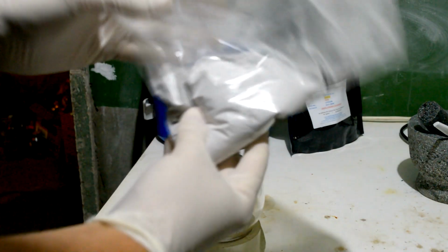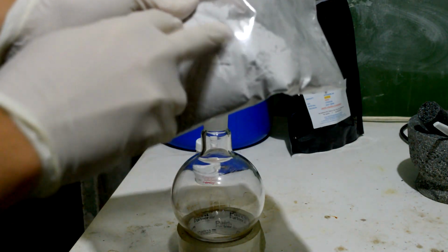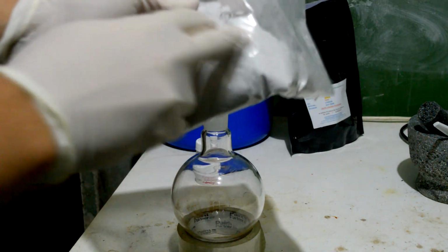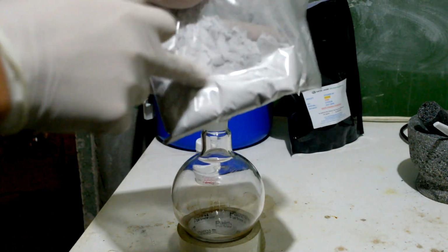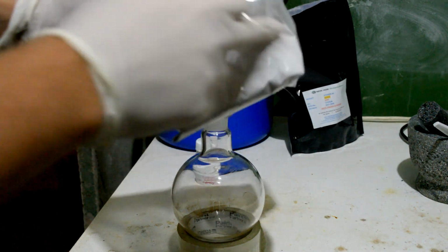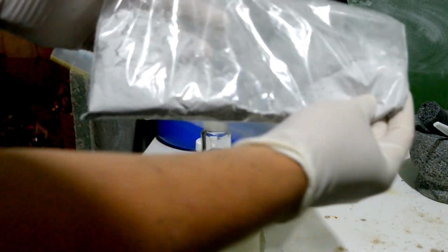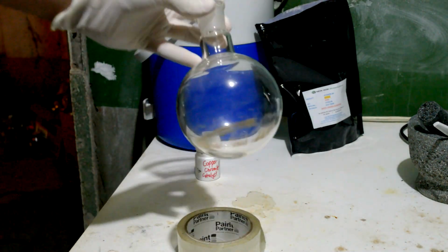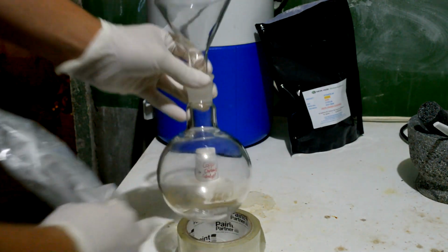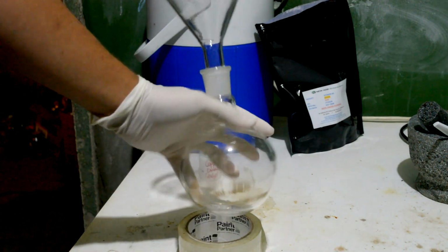So we're left with this even grey powder here. I think I could have done a lot better with crushing up the chromite catalyst initially, because you can sort of see some black flecks through it, which is kind of a bit of a wasted catalyst. But overall, I think it's fairly good. So we're now going to try and get it into the flask without spilling. The flask is a little dirty. You can see it's quite stained, but that won't make a difference in the slightest, and it'll stop me wasting time just cleaning it.